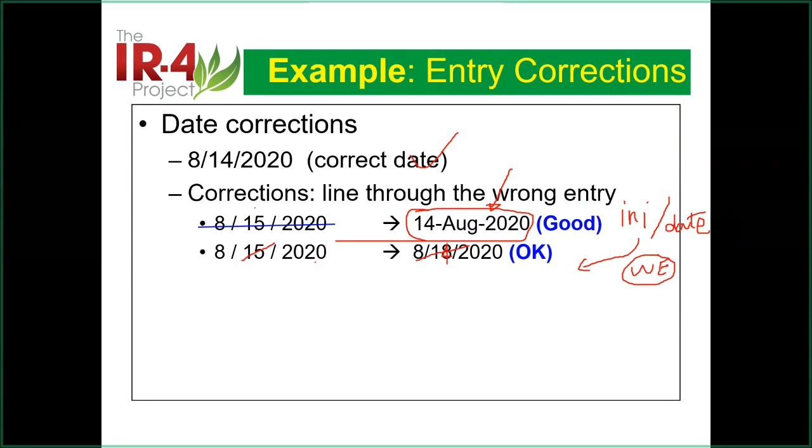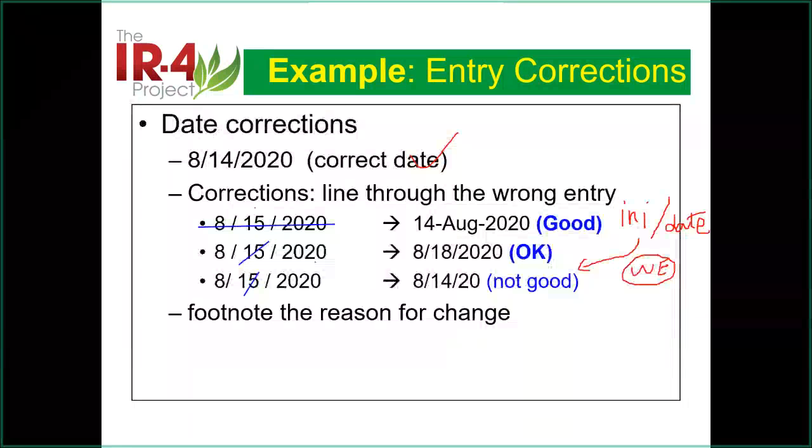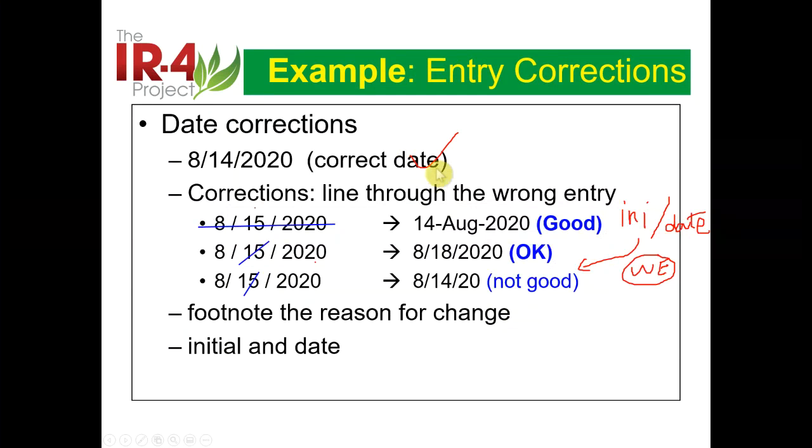And sometimes, well, let me erase that. Looks like it's too many. Erase that. Could be 14. But, okay. So that should be okay. And sometimes people just cross one letter or one number. It is okay with some people, but I don't like that. So you have to put the reason there. So let's erase what we have. Let's do it again. This is typical.